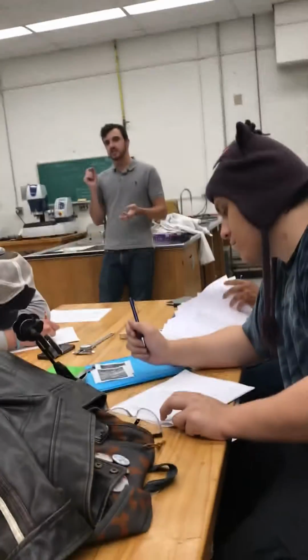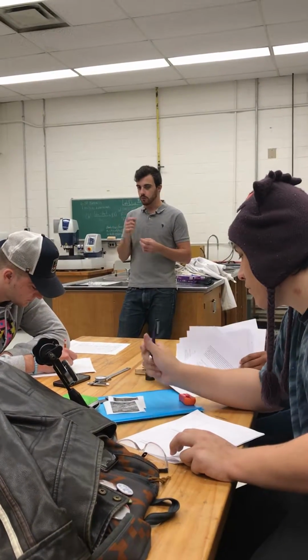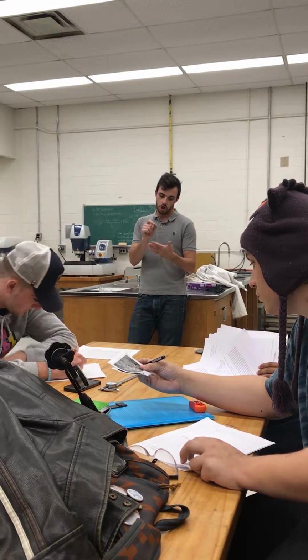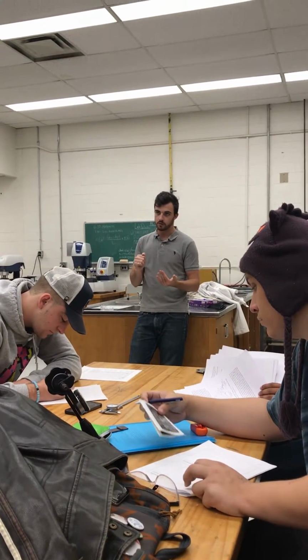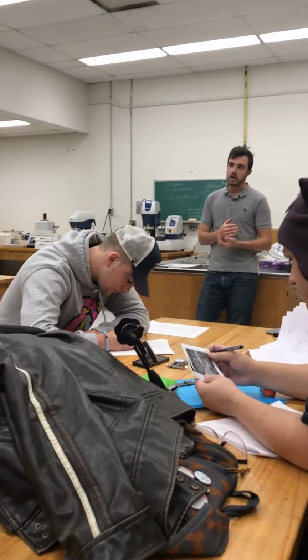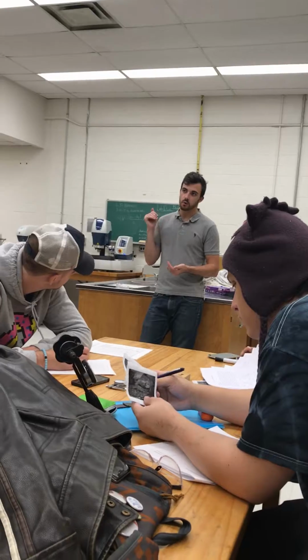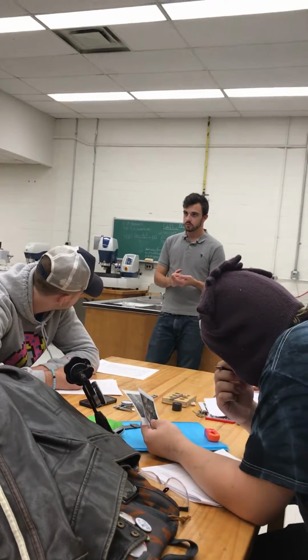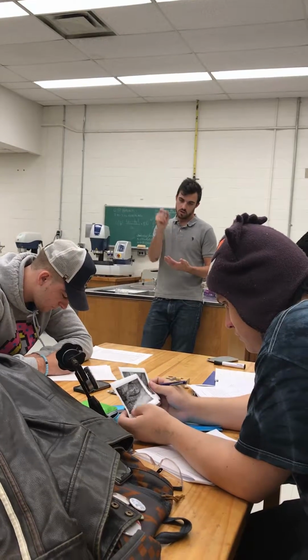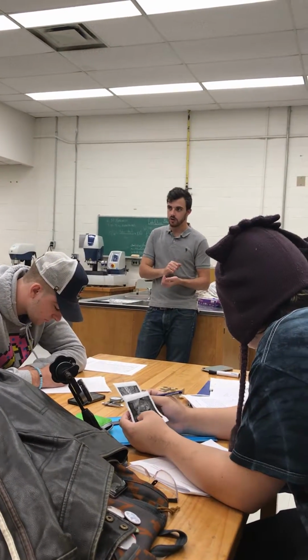Then you're going to take a pen or pencil or marker, and identify and outline a grain on the micrograph. You're going to do this for both the compressed grain structure as well as the annealed equiaxed grain structure. Is that clear? So take a pen and just outline a grain.